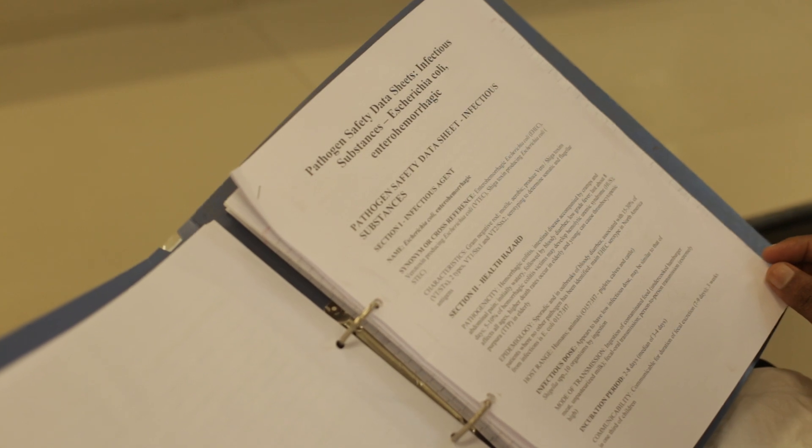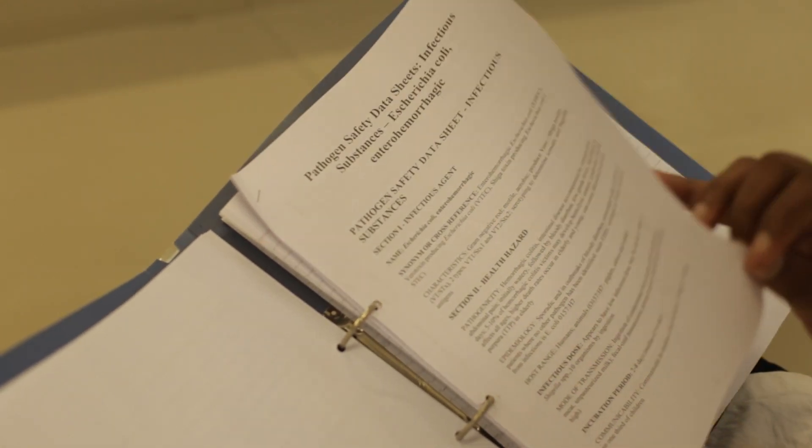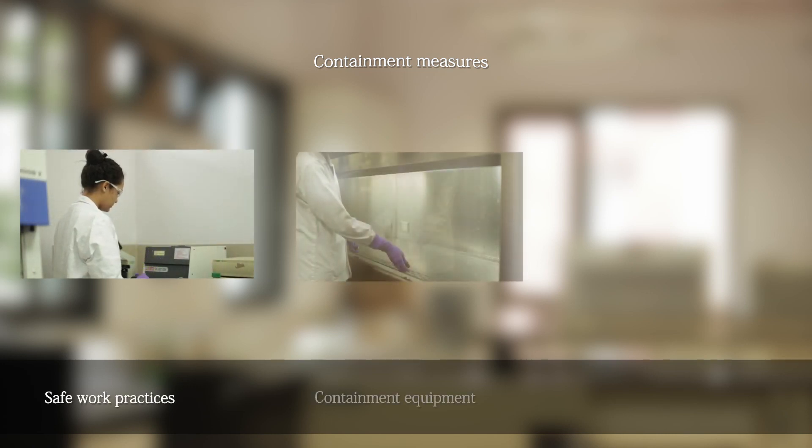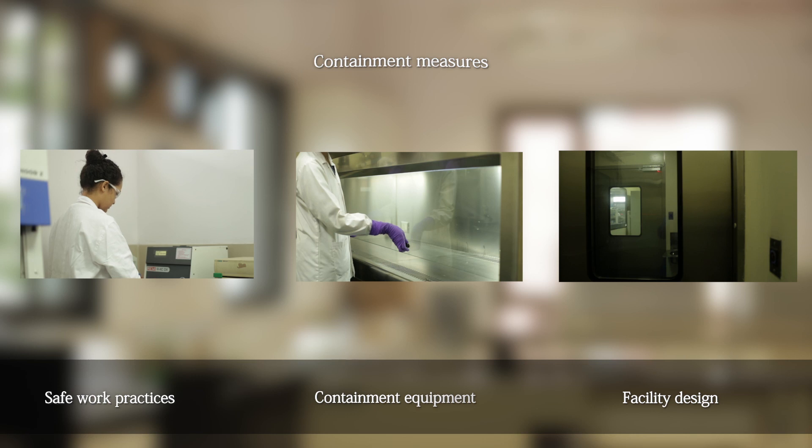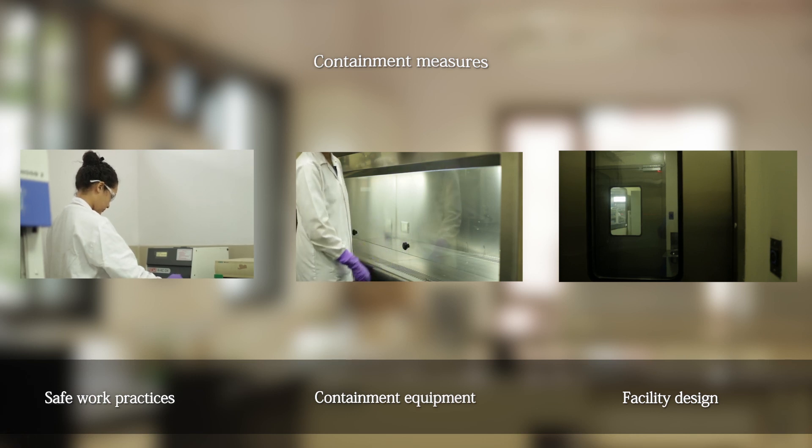You must know the modes of entry and related hazards of the pathogen before you start working with it. Containment of bio-risks can be achieved by safe work practices, containment equipment, and facility design. Depending on the risk level of the pathogen and other related hazards, facilities dealing with bio-research work are classified into the following biosafety levels: BSL1, BSL2, BSL3, and BSL4. The containment measures increase from BSL1 to BSL4.